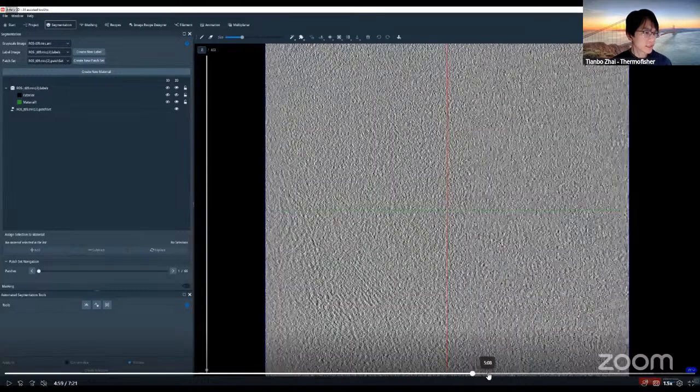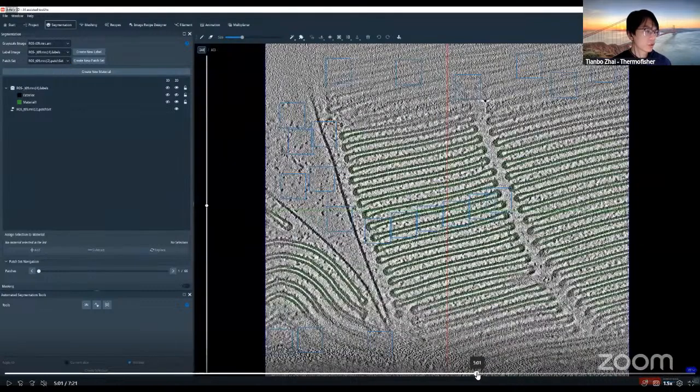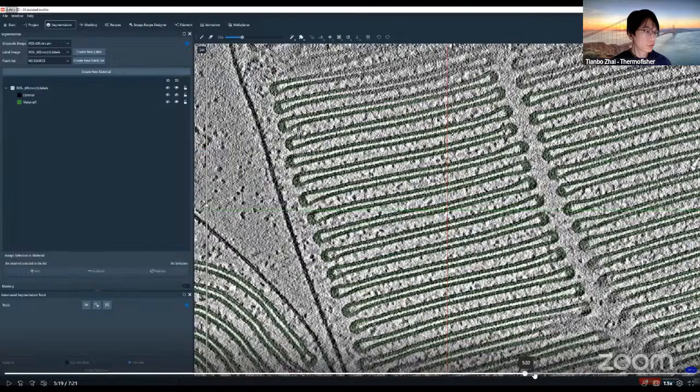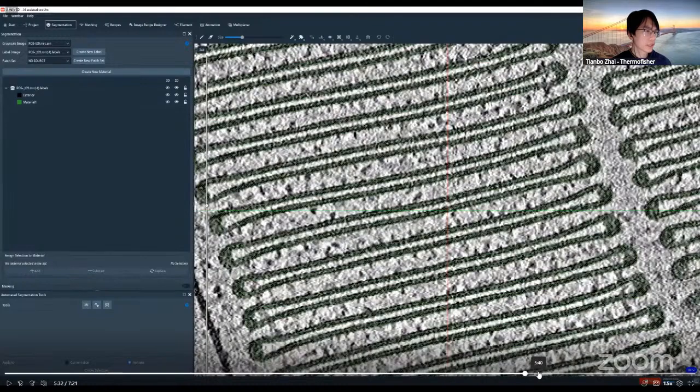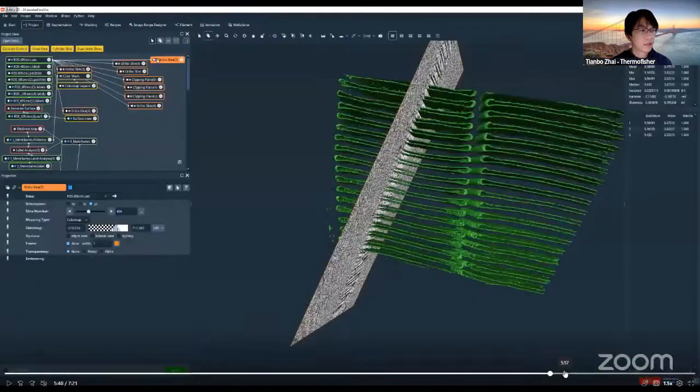So this is the subsample that the machine will receive. And after the machine receives the subsample, the training process will happen. And then the prediction will in turn provide, again, an educated guess across the whole 3D imaging data set. And we'll be seeing the full predicted membrane structure.